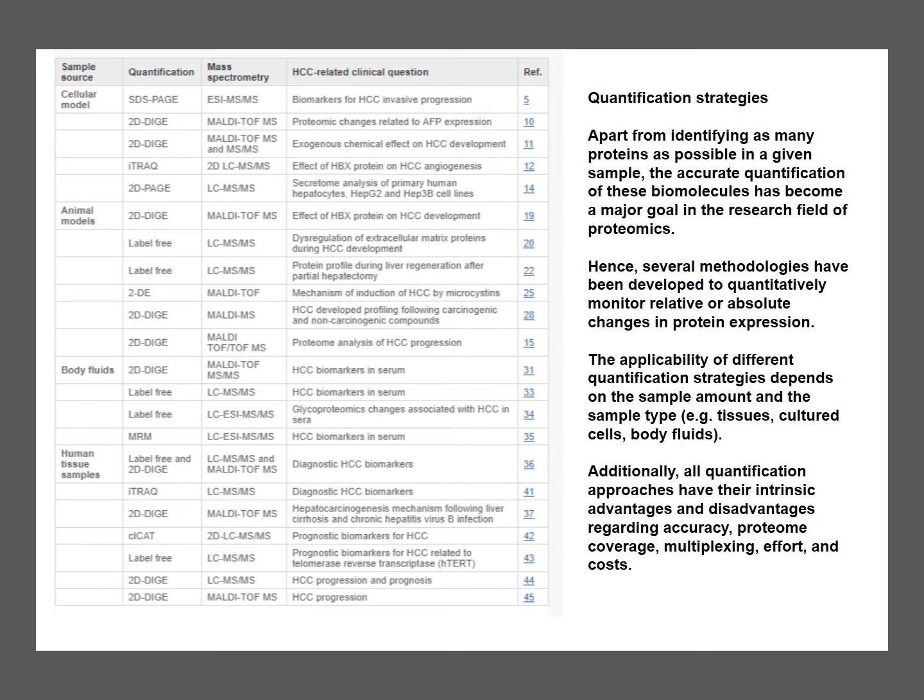And each different approach will have positives and negatives here. And in these kind of experiments, you're going to have to do multiple runs. In other words, you don't want to just make conclusions based on one roll through it. You're trying to figure out what's going on. You're quantifying the advantages. How accurate are these experiments, right?